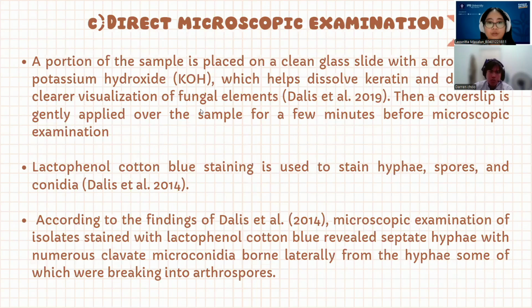And then we move to direct microscopic examination. A portion of the sample is placed on a clean glass slide with a drop of 10% potassium hydroxide or KOH, which helps to dissolve keratin and debris for clearer visualization of fungal elements, according to Dalis et al. 2019. Then a cover slip is gently applied over the sample for a few minutes before the microscopic examination.